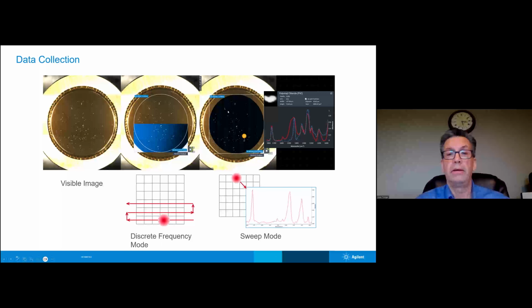And as you can see here, the solid line is the infrared spectrum of the sample that was collected, and then the dashed line then is the library spectrum. And so essentially it just matches up the peaks, and it does its identification. As part of that, we get a hit quality index. So that tells us statistically how well the collected spectrum matches that of the library.